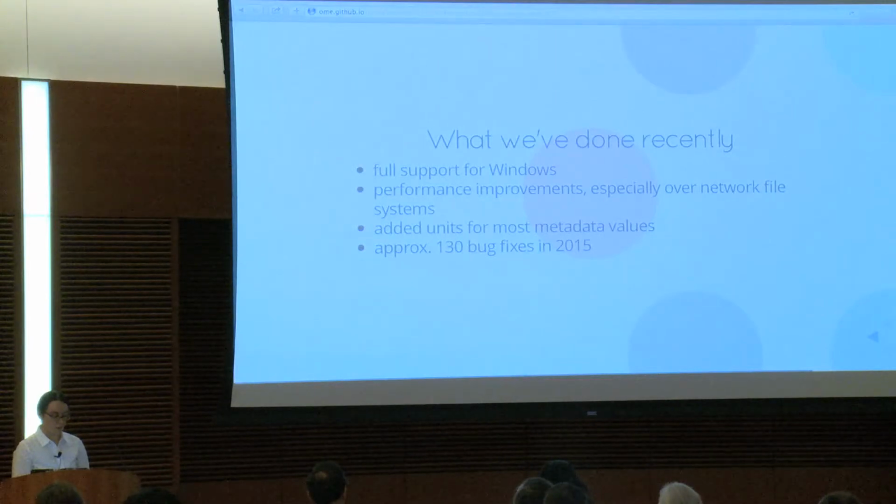We've also updated the OME XML schema and the corresponding parts of Bio-Formats to allow the units for specific metadata values to be recorded along with the values themselves. Previously, something like the physical size of a pixel would only have been stored in micrometers, regardless of the imaging modality. Now we can store that in any standard unit based on what makes the most sense for how the acquisition was performed.